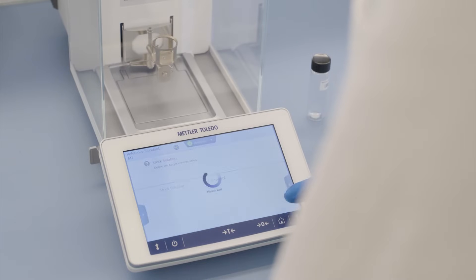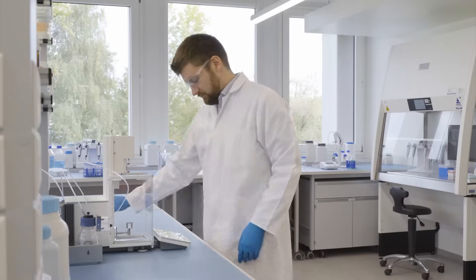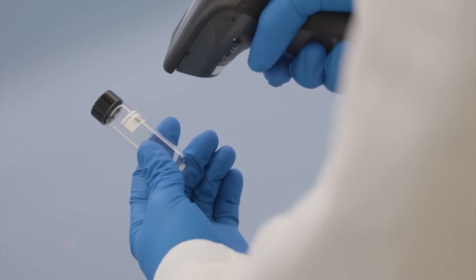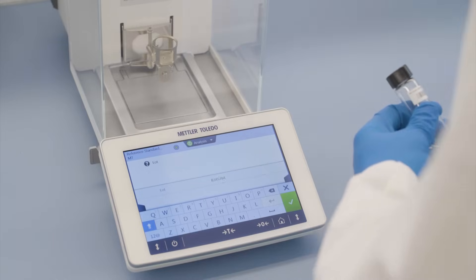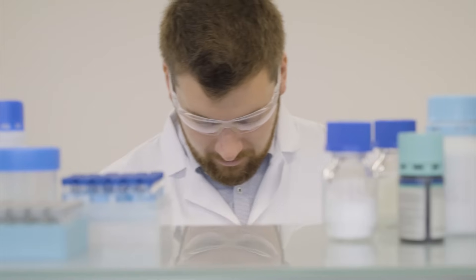LabX uses the parameters in your SOP including target weight and concentration as well as the purity of the reference standard from your database to ensure you get precise concentrations.